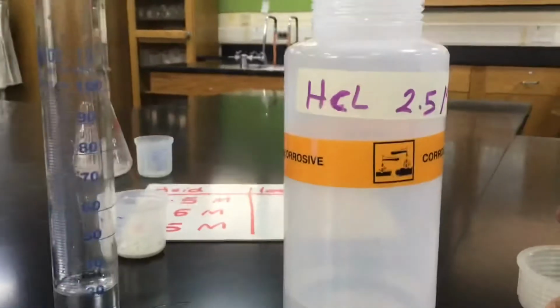There we have 2.5, lid straight back on. Okay, sealed up, and pour that into our conical flask.